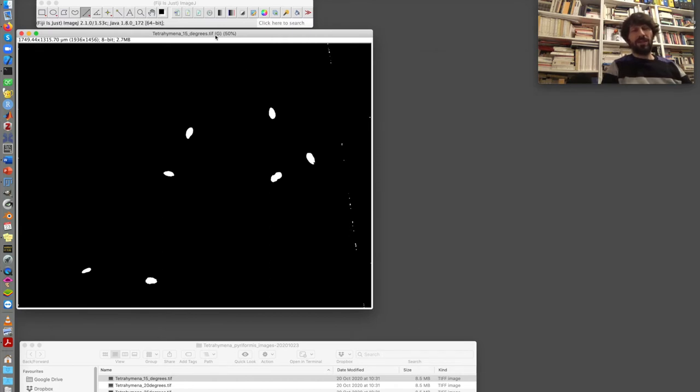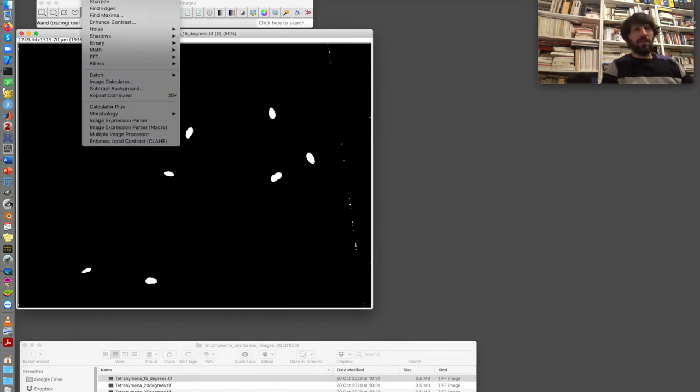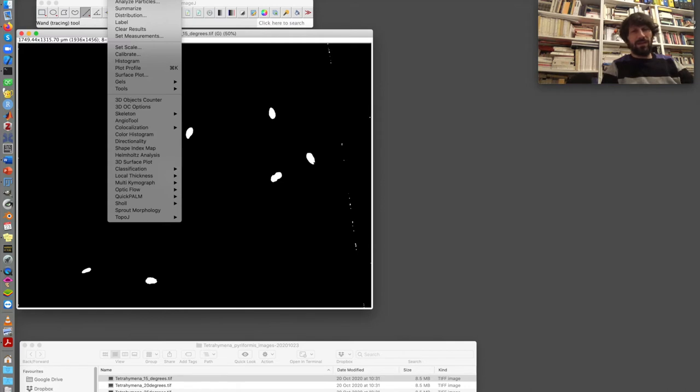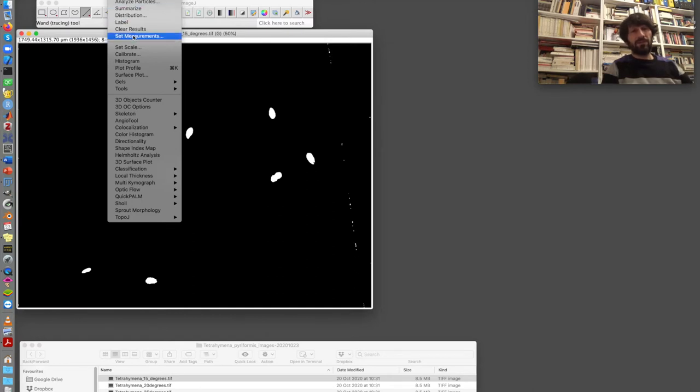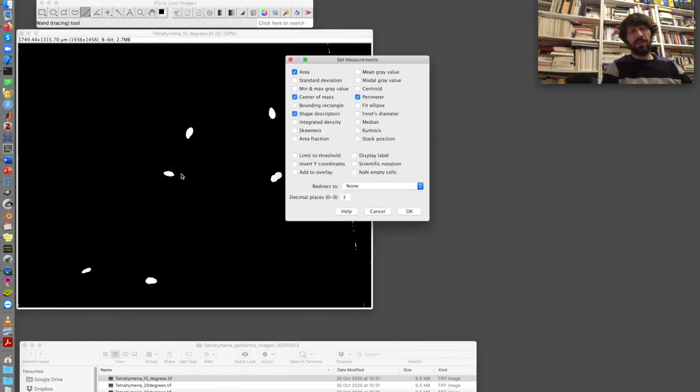I'm ready now to analyze these objects. Unfortunately, it is not that many Tetrahymenas in this image, but I will do with what I have. In a normal experiment, I may analyze more than one image, of course. So this is the analyze menu that is important for me. Before I start analyzing these blobs, these particles, I go to set measurements. So analyze, set measurements, to check what kind of measurements I'm taking of these objects. And currently, I'm taking the area, the perimeter, the center of mass, and the shape descriptors.